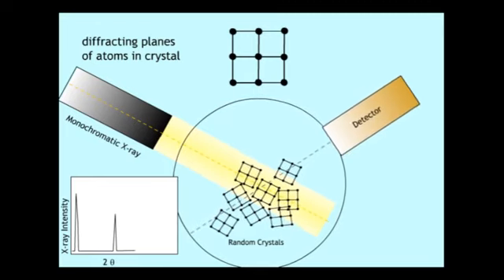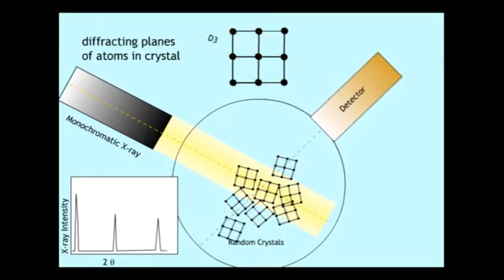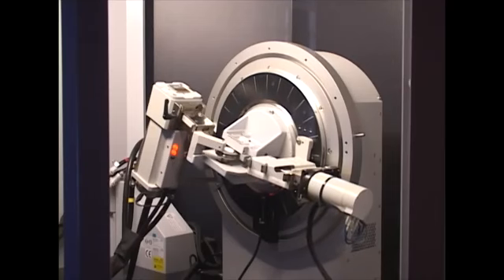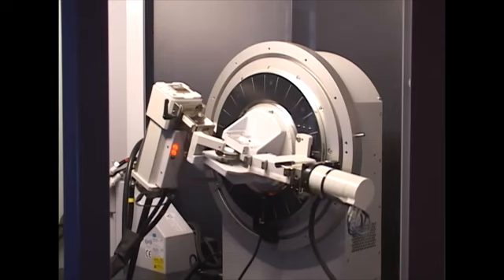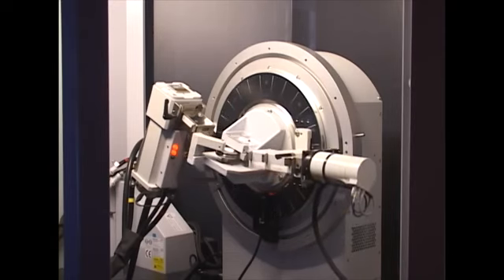It is important to have a sufficient number of crystals to have an even distribution at all possible crystal orientations. During a scan, the detector is rotated over a range of angles to detect bands of diffracted X-rays produced by the correctly aligned crystals within the sample.